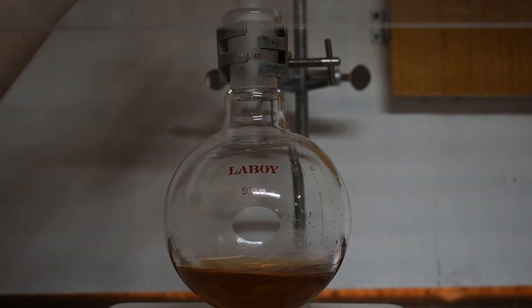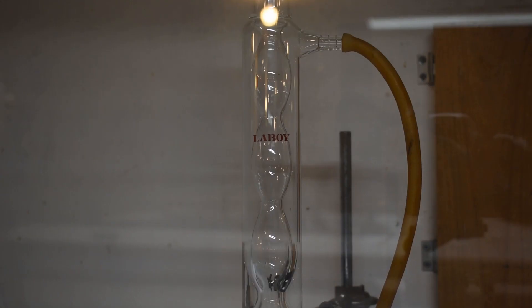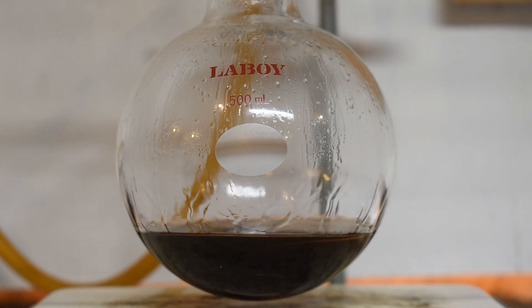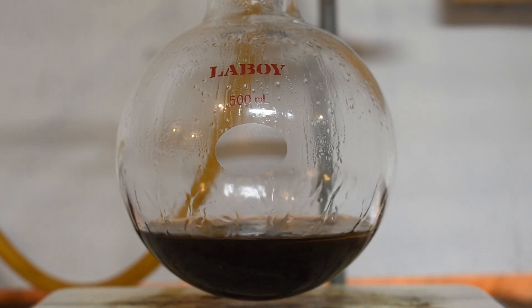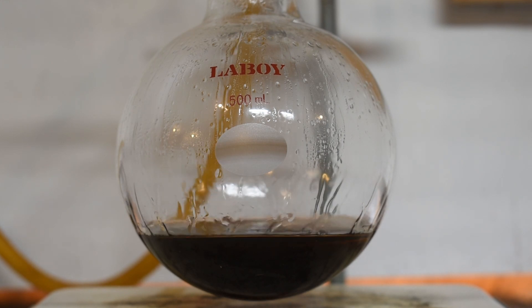After I finished adding my reactants, I added a reflux condenser to the top of the flask and began heating. As you can see, the hotter the mixture gets, the darker it gets, but that's okay because these impurities will be removed in later steps.